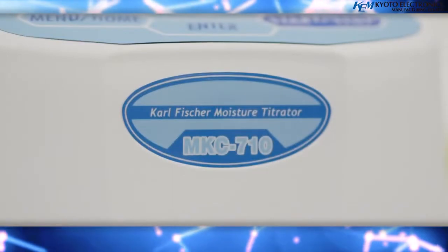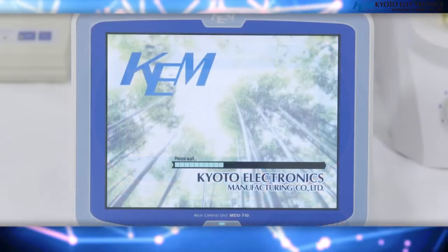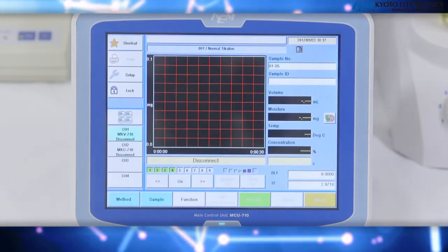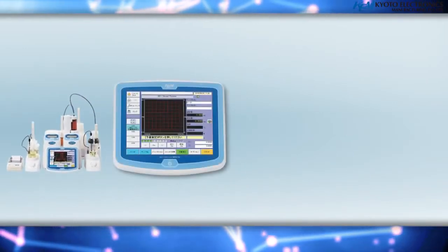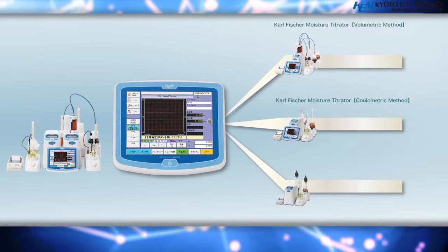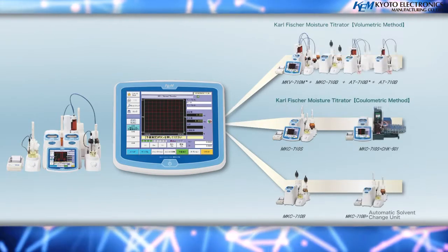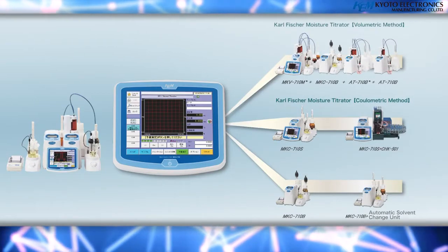By connecting up to 4 moisture titrators, measurements can be performed simultaneously in parallel and contribute to saving space. Not only can the Karl Fischer moisture titrator's coulometric titration, MKC 710B, and volumetric titration, MKV 710B, be connected, but the automatic potentiometric titrator, AT710B, can also be connected as well.